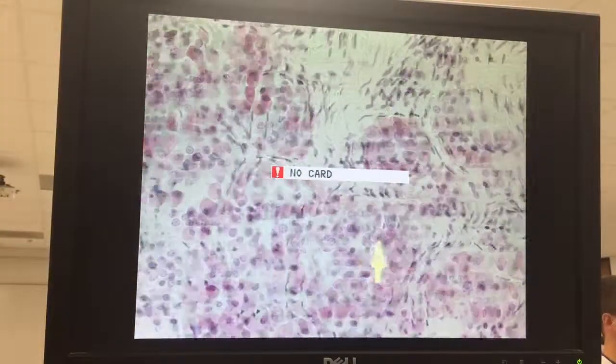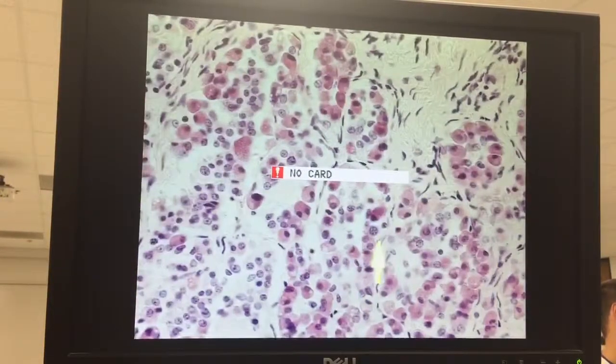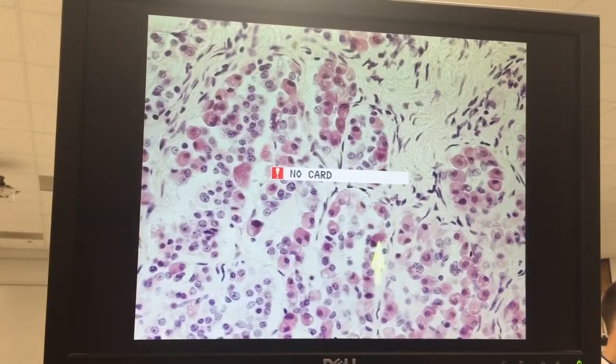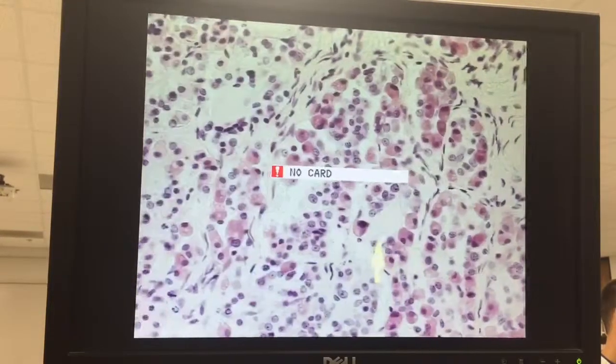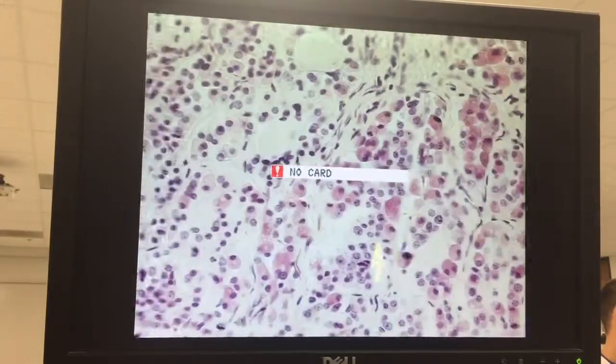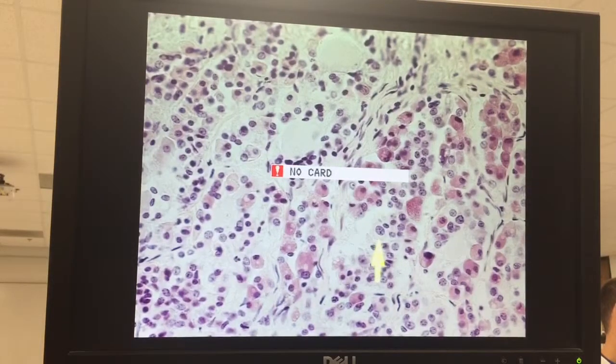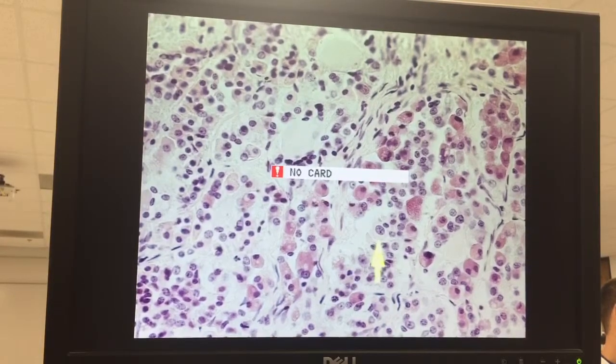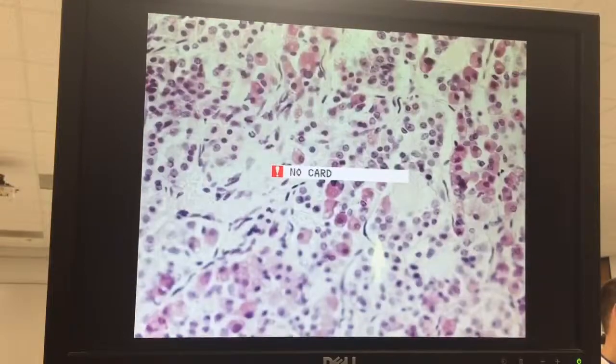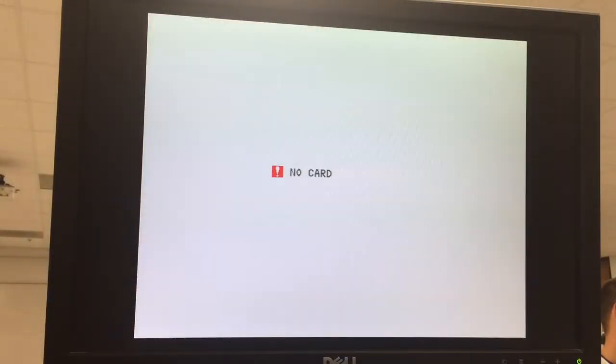Here, so we've got an acidophil right there, another acidophil. And in this case the basophils are a little bit more muted and they're staining. Now on a slide like this I would not try to identify a chromophobe.